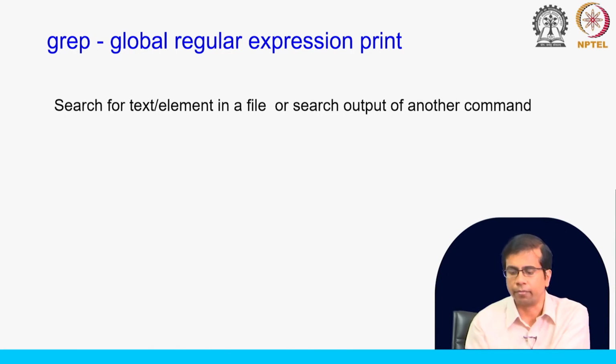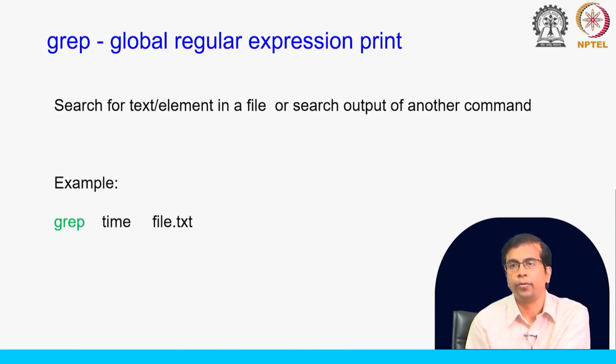We will use this for a very simple kind of task. We want to find a specific name inside a file. For example, we want to find a read name inside a file, or once we have done the NGS data analysis and have got the mutation data, we want to look for certain chromosomes. Maybe there are mutations in certain chromosomes that we want to look at, let us say chromosome 5 in the human genome, because that might be useful for certain disease identification, classification, etc. So this very simple task of grep could be very useful for many applications.